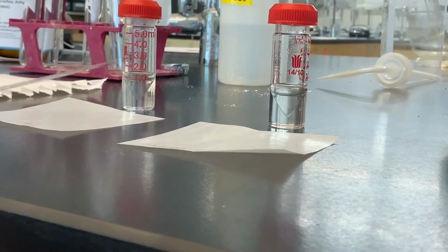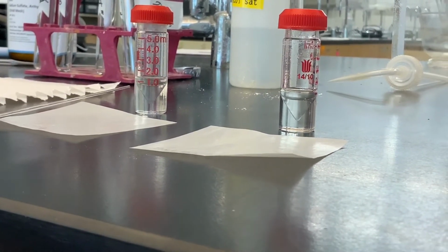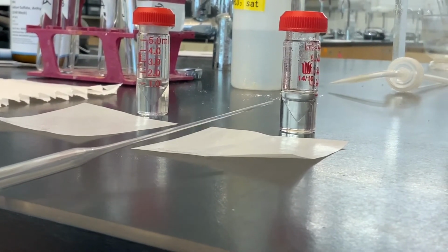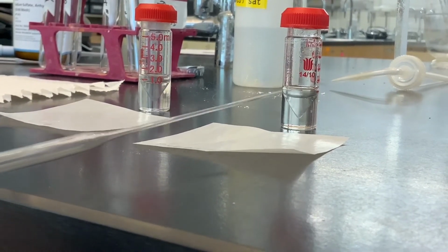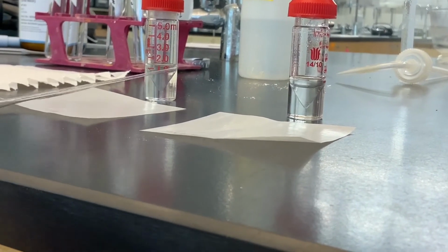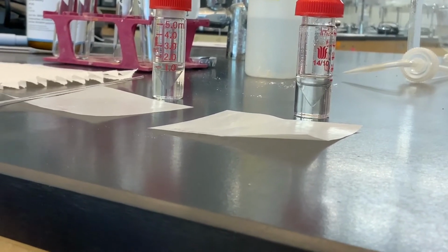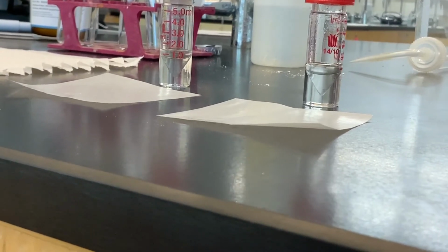So once again, we're expecting the native benzoic acid to be more soluble in the methylene chloride layer here, and there's the acid-base reaction to give the sodium benzoate, so we expect that salt to be more soluble in the aqueous layer, and so when we try and recover the methylene chloride layer, the organic layer from these two, we'll expect that there'll be more benzoic acid from part A and less benzoic acid from part B.